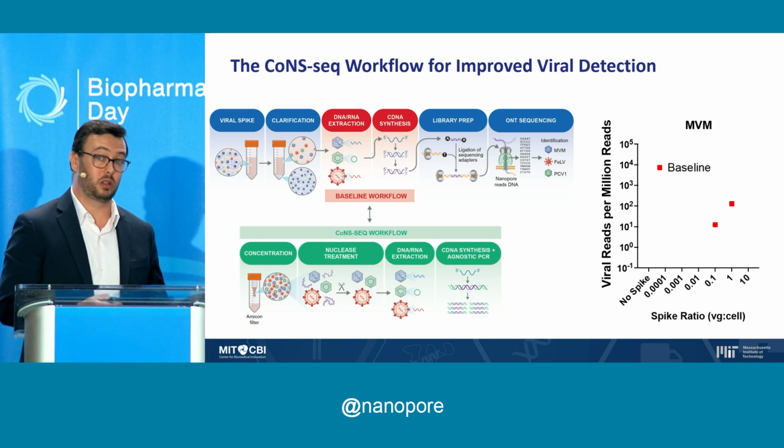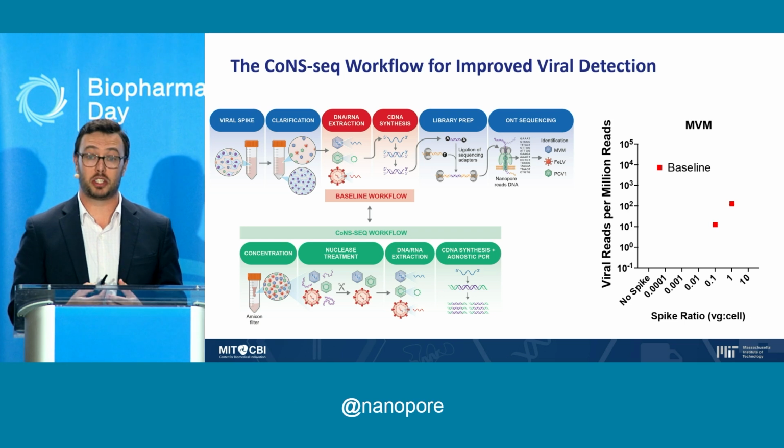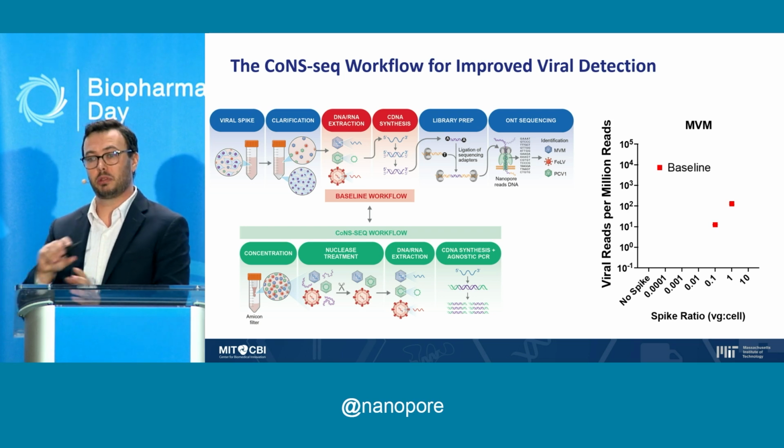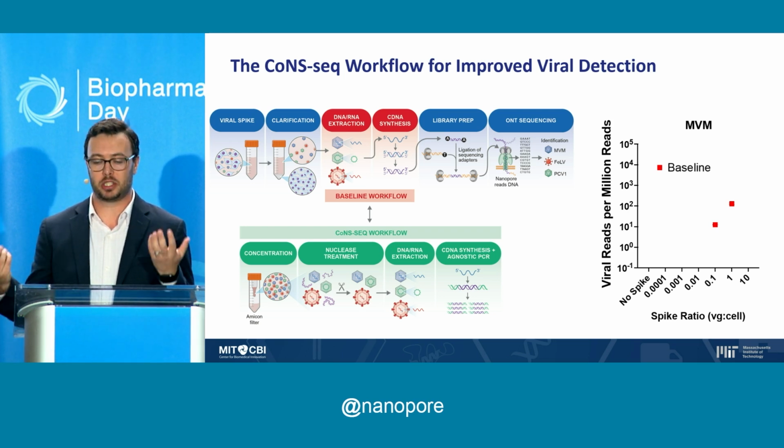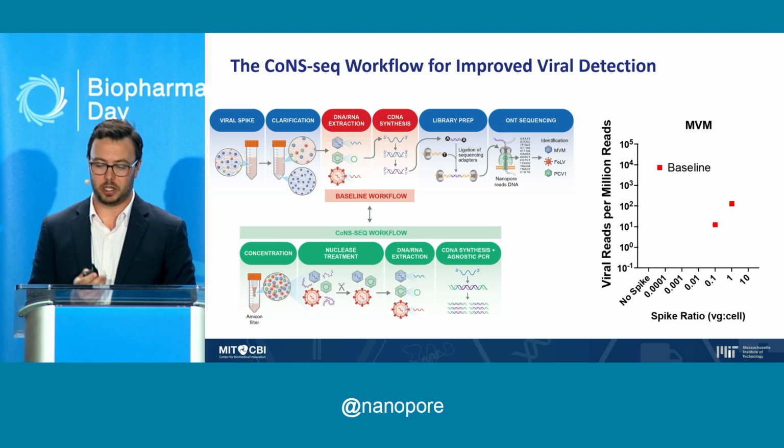And it's critical that this happens after we do the nuclease treatment and all the other steps, because the first steps allow us to remove all the host background. If we just started with the agnostic PCR, we'd amplify everything and we wouldn't be solving our issue.